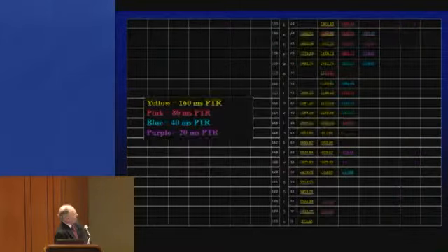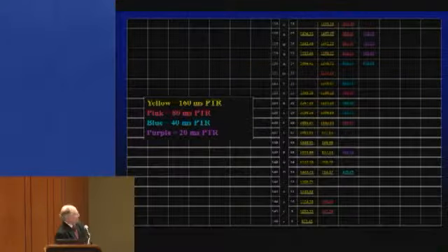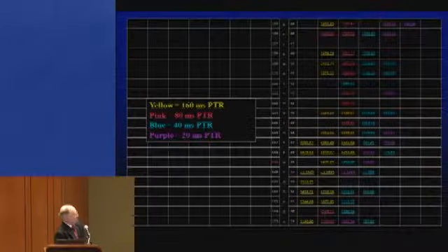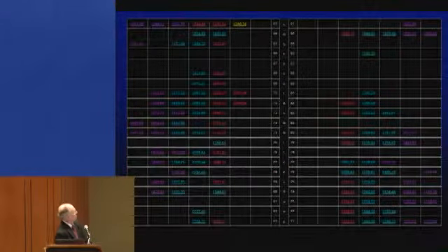Now if you go down to the bottom and look for the other end of the protein, here's the amino acid at the C-terminus, and remember we didn't see the first 6, but we did chemistry, and then we saw the first 6 amino acids, so we know what they are. And now go backwards up: here's +1s, +2s growing in, complete sequence coverage, and then with the shorter reaction times of 80 and 40 milliseconds, the others grow in up to +7s. Again, when you work your way all the way back, we're seeing ions up around 83, 84 amino acids into the chain. And now they begin to overlap with what we see on the C-terminus as well.